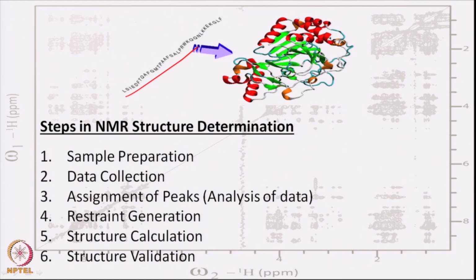As you know, we have 3 techniques primarily used in structural biology for getting the atomic resolution structure of any biomolecule. One is crystallography, where you need to crystallize the protein. You concentrate the protein, then put it in crystallization conditions. If you get a crystal, this crystal must diffract, and after diffraction you can determine the structure of the protein.